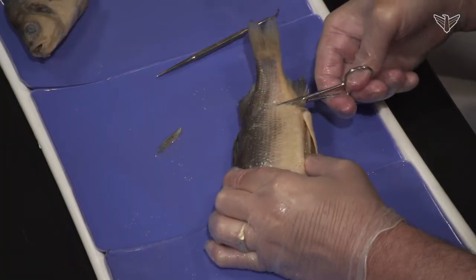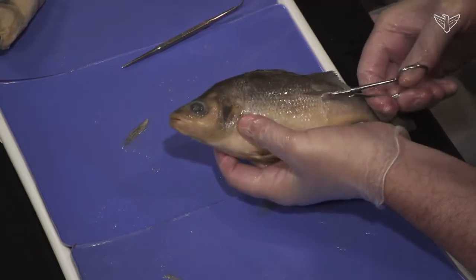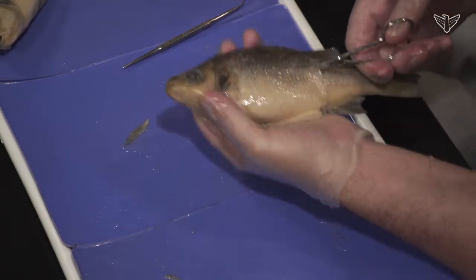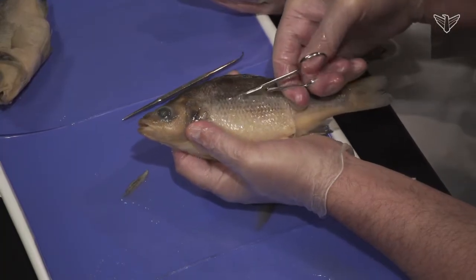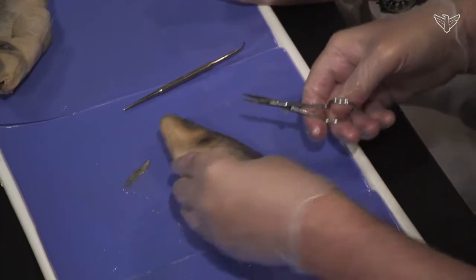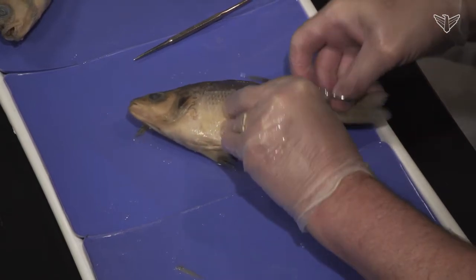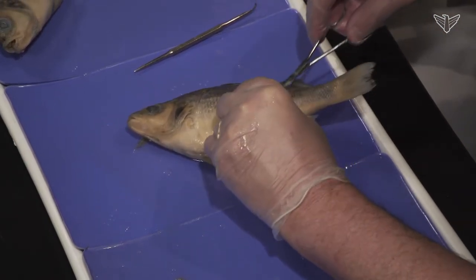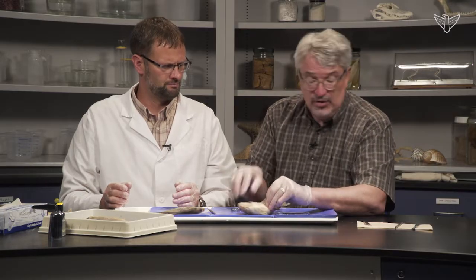Once we see the reproductive structures — the gonads — regarding reproduction: the females will lay the eggs externally and the males will spread the gametes, the sperm, over them. Some fish like bass and bluegills will guard nests and things like that, so there is some external parental care with certain species.